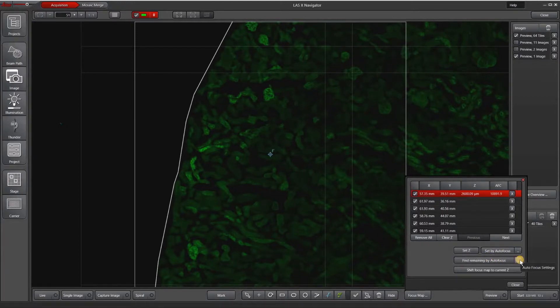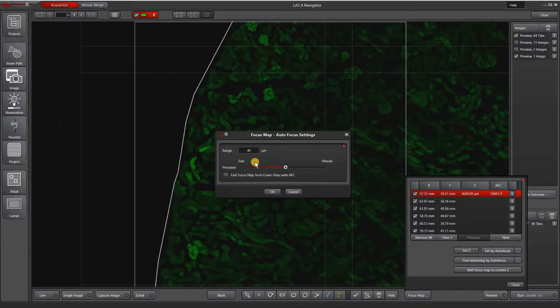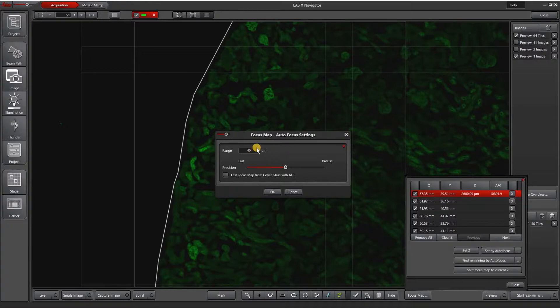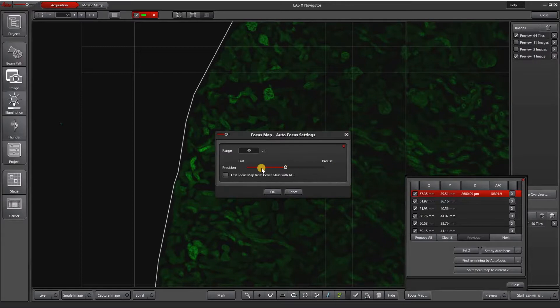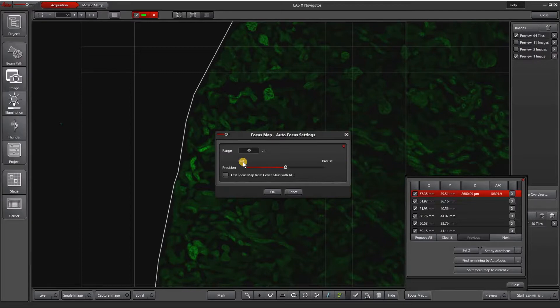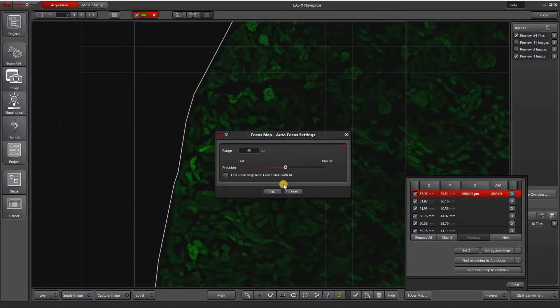To check my autofocus settings, I'm going to hit this dot dot dot to bring up this focus map window. It shows me the range, just 40 microns. This is basically the Z stack that it's going to run the autofocus on. The number of Z slices is configured using this scroll wheel. It doesn't tell you how many Zs we have, but basically fast is less number of Z slices and precise is more number of Z slices. Usually something in the middle works quite well.